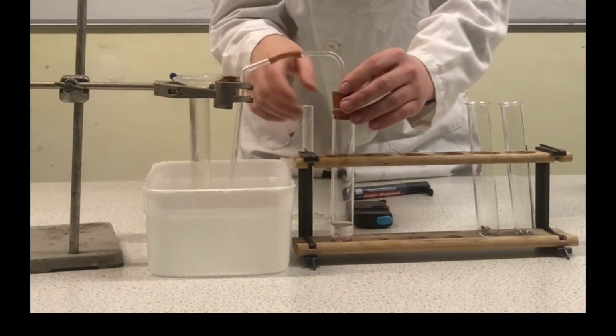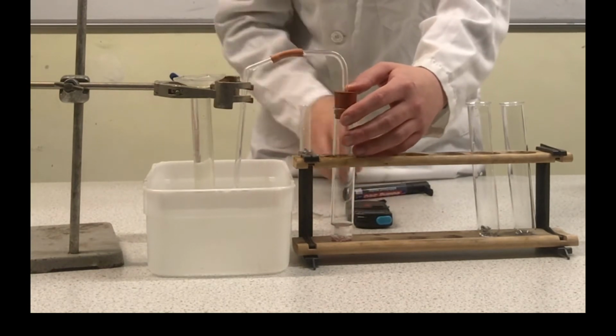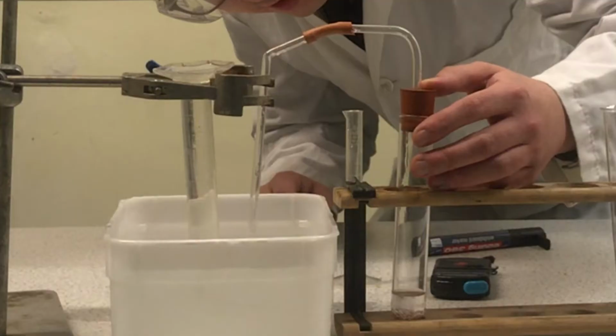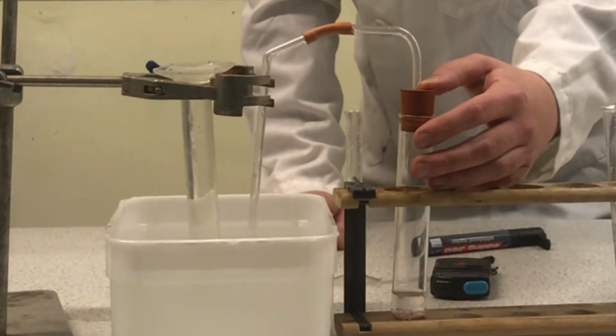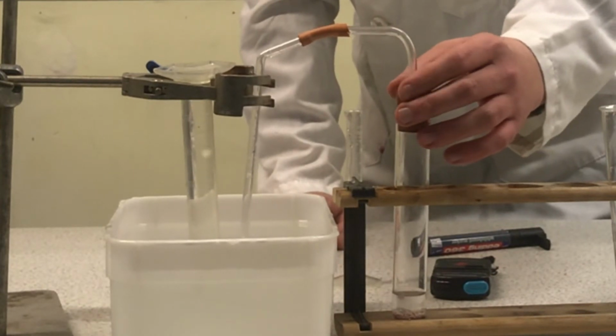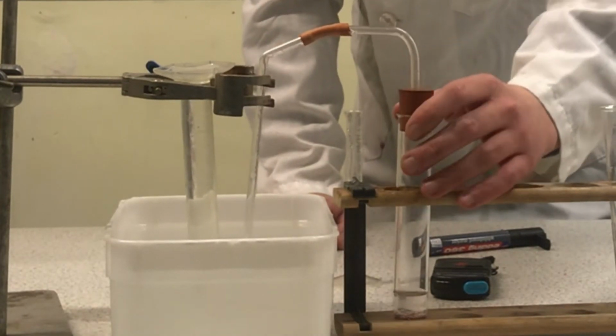As we can see, this is reacting quite a bit faster. It is producing bubbles much quicker than when added with zinc alone.